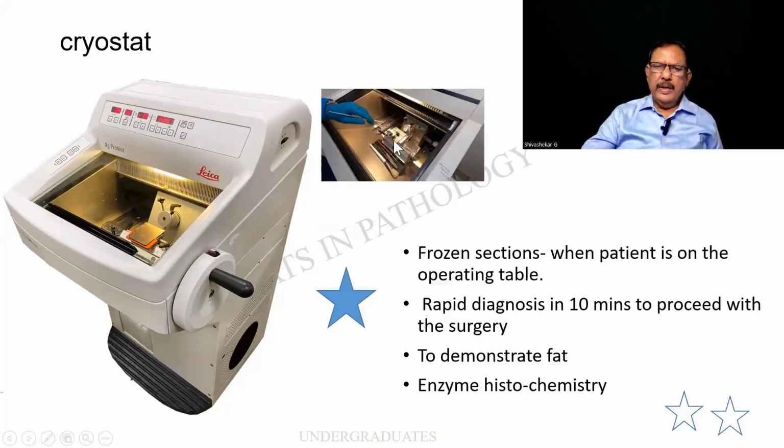Now, what is the advantage? Why are we in such a hurry? Because the patient is on the operating table. Within minutes, I have to give the diagnosis, a rapid diagnosis, so that the surgeon can proceed or alter the surgery. To demonstrate some substances like fat, they are dissolved during processing, and some enzymes are also destroyed. And to retain them, the frozen section can be done. This also can be a question.